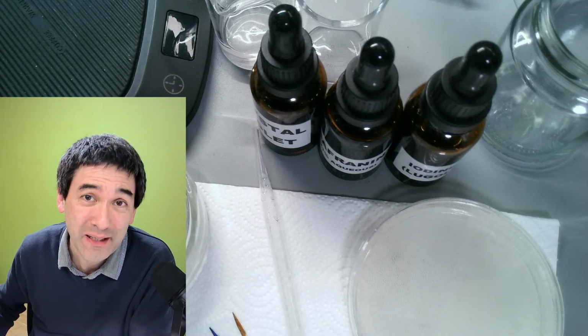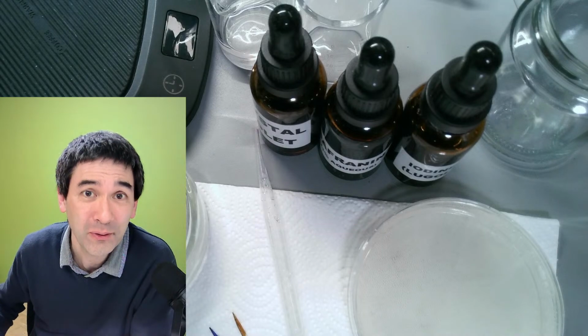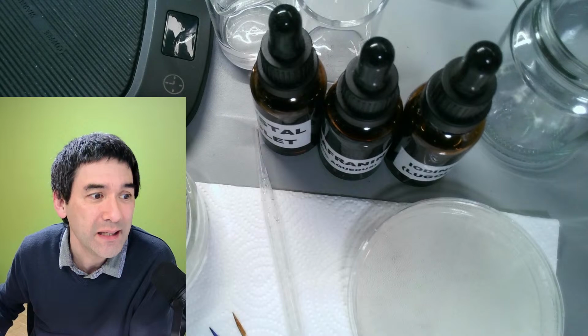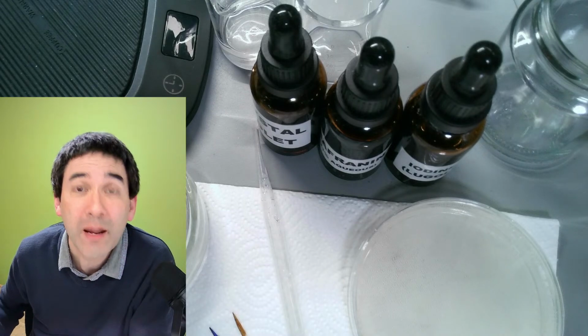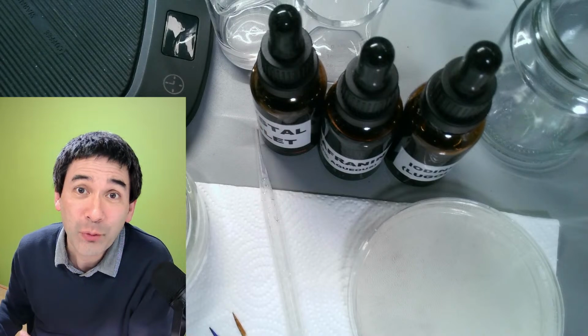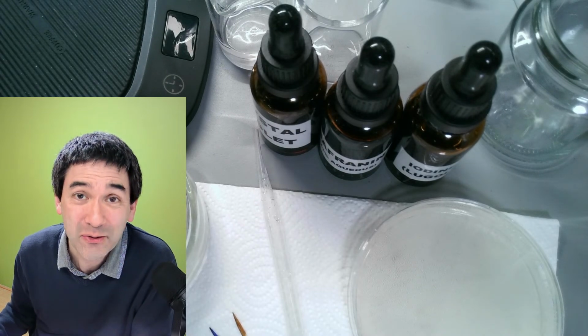Today I'm going to do again a little bit of lab work. It's a requested video. Basically, I'm going to do a so-called Gram stain. Let me quickly check here. I need to get everything sorted out here. A Gram stain is a very important stain in microbiology, and I'm going to give you a live demonstration of this Gram stain today.